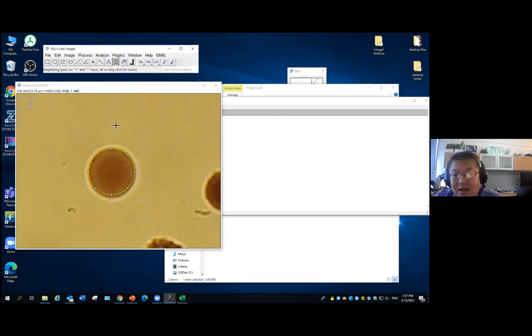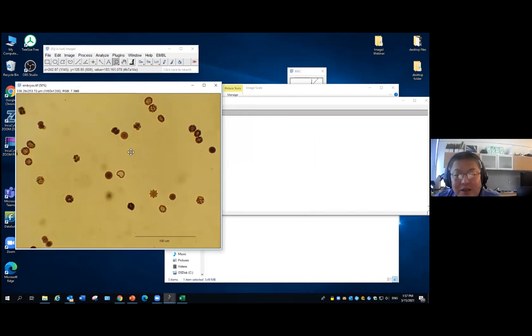So this is for the case you have an image. Sometimes you lost how you got the image. You just have the image somehow, but the scale bar was added by the acquisition equipment. You can do it like this.